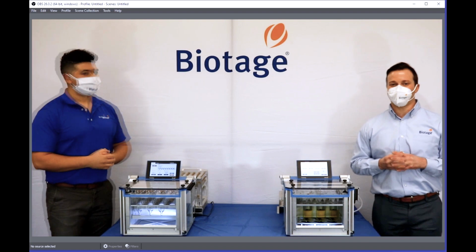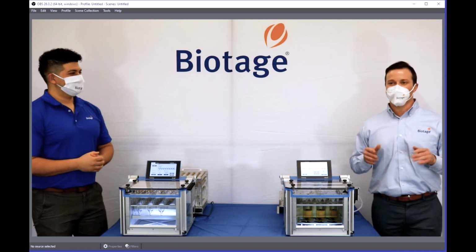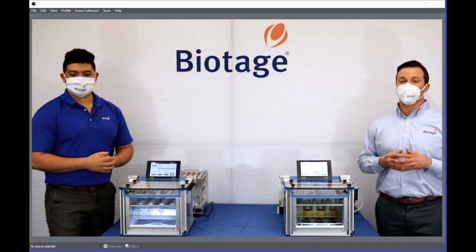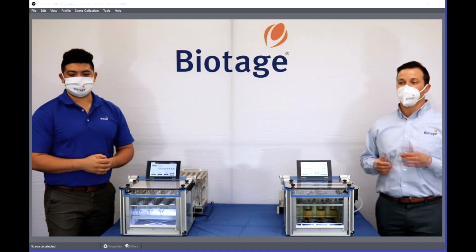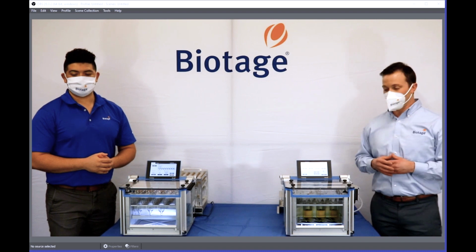Sorry about that. When you want technology to work, it just doesn't happen that way. But we're glad to be back, bringing you back to the TurboVap systems. Today, we're going to show you the flexibility and the versatility of our TurboVap system and how you can concentrate a range of volumes and program the system for the solvents that you're using.